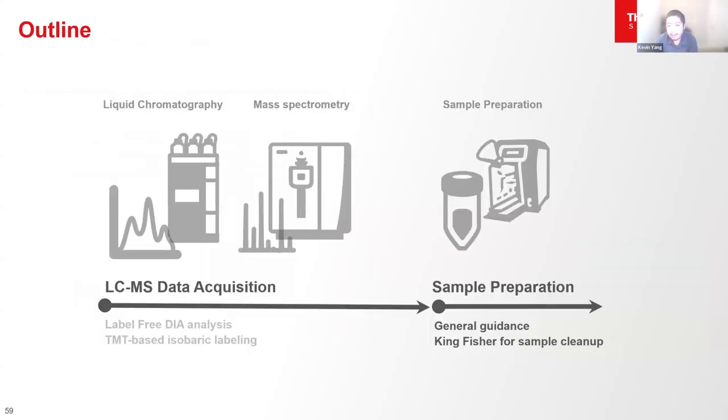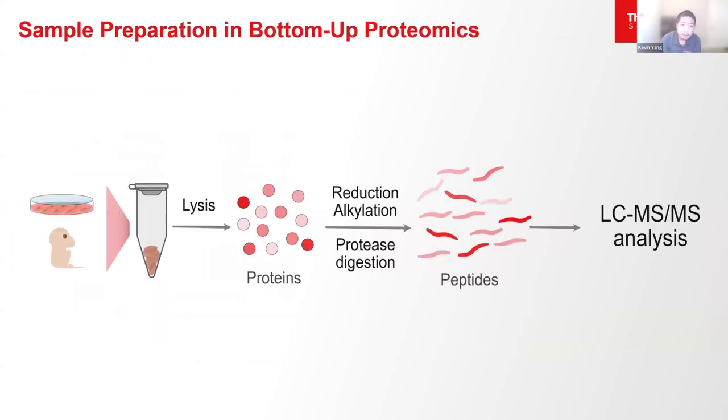All right. And at the end, I just want to touch base really quick on the sample preparation and the potential solutions that Thermo Fisher can provide. Many of you have probably done this before, but I just want to walk you through the process again, to ensure everyone's on the same page.